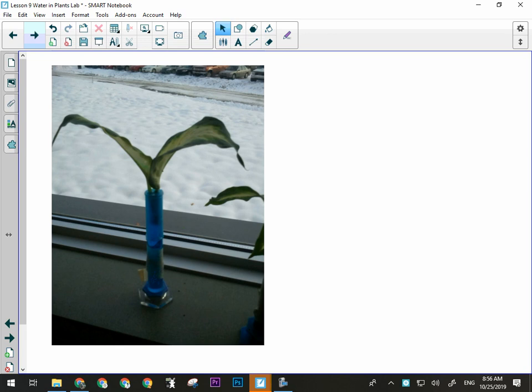You're going to have the leaf sticking out of the rubber glove, okay, that's wrapped over the top of the graduated cylinder, and we'll give you a piece of masking tape to wrap around the graduated cylinder and write your name on, okay? That way, on Monday, we can tell whose is whose, because there'll be this class and my period 4 class all sitting on the windowsill. Okay? So we need to make sure we can tell them all apart. Okay? Everybody with me there?